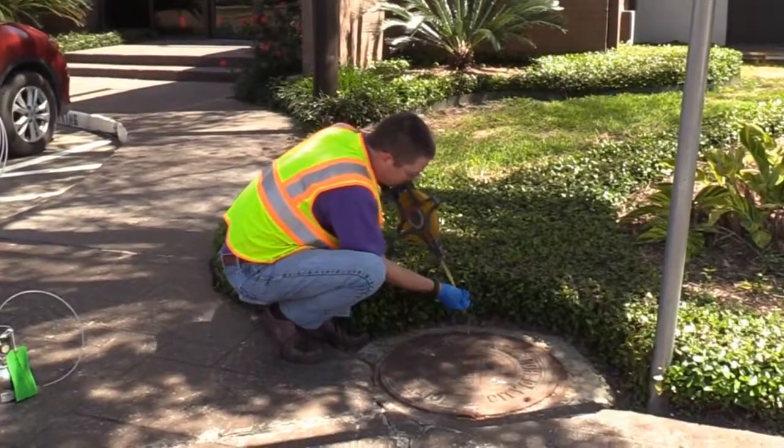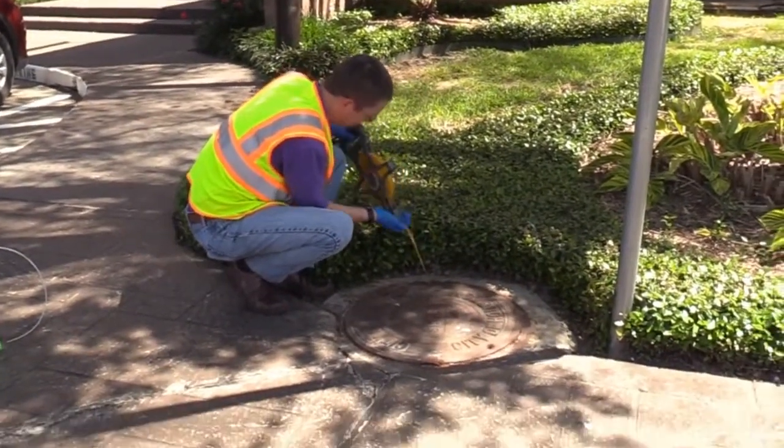The first step is to measure the depth of the manhole and to check for the presence of standing liquids. This can be done using a water level meter or weighted tape measure.